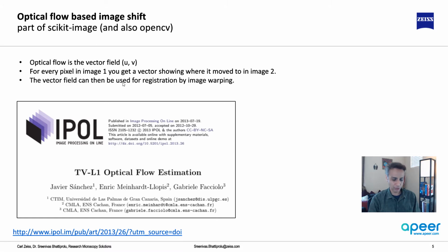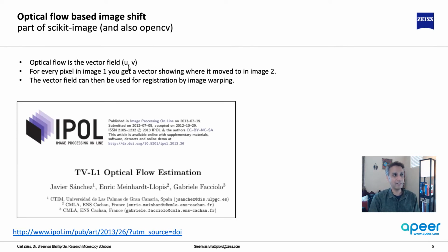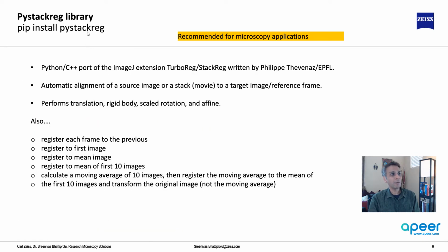The examples I showed you earlier, think of these as just 2D translations, right? So you get like the mean image is moved by these many pixels in X and these many in Y. Here you're actually getting it for every pixel. So which means by definition, this would be a much better approach. And both of these are sub-pixel, down to sub-pixel level. Okay, so your movement will be like 18.235 or something.